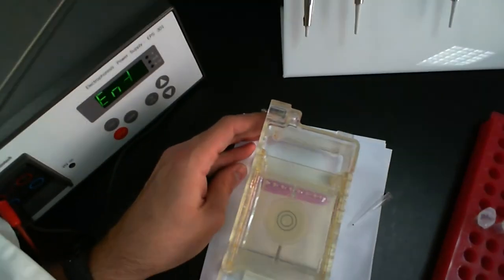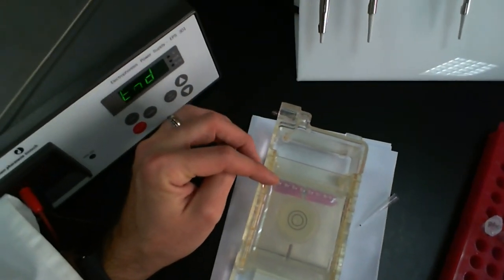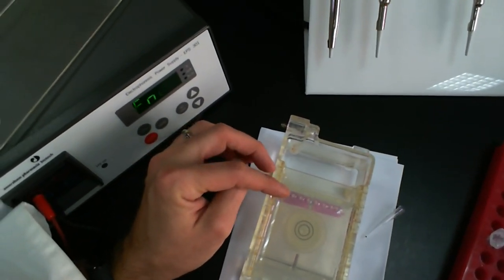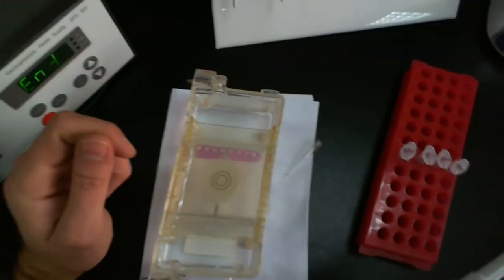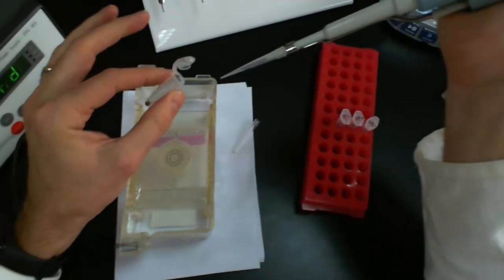Okay, and so I'm going to load. I'm going to leave the first well blank. That's going to be for the molecular marker, and I'm going to load the next 4 wells after this. So my first sample, P1E, 25 microliters.